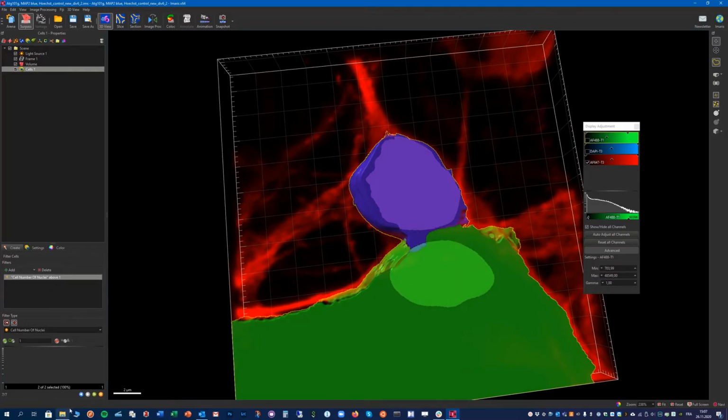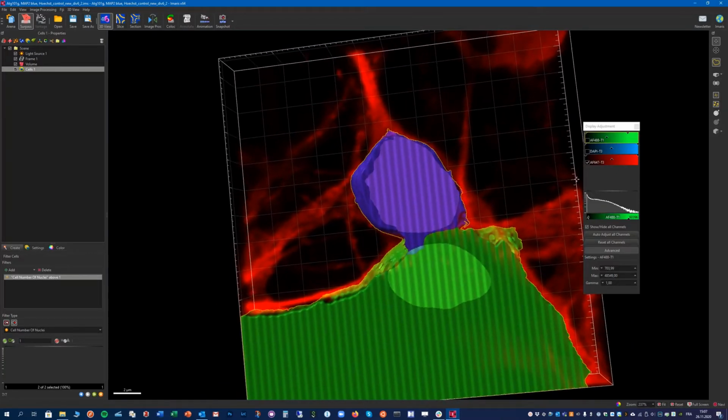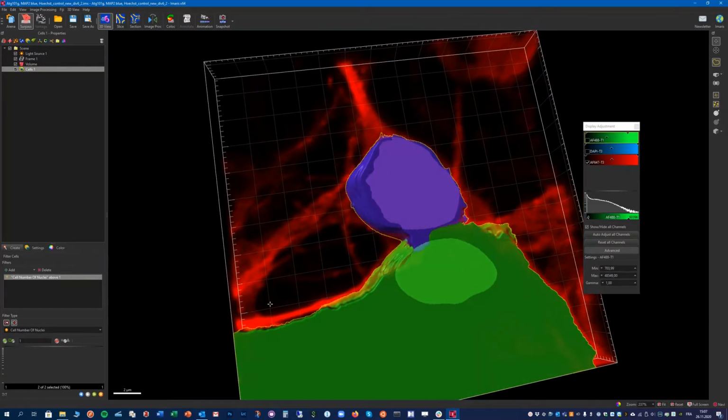We have no more parameters to work with, so as you can see, it's maybe less ideal than using the green signal here. If we are still satisfied, you can finish here and get the statistics as previously here.